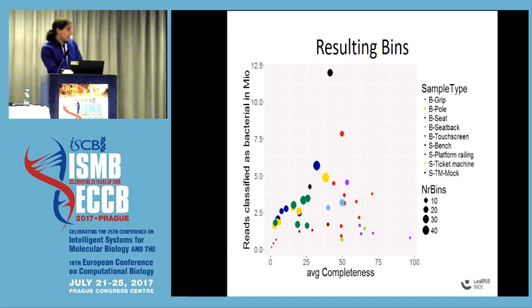So why is that? As I added before, when I have a very low diversity, as the rare species were not properly sequenced, whatever the issues are, this makes it very easy for me to assemble the most abundant ones because I have fewer disturbing factors, and thereby I can obtain very complete and very clean bins. In contrast, if I have the real diversity, including a proper sequencing depth of the low abundant ones, this does affect my assemblies negatively.